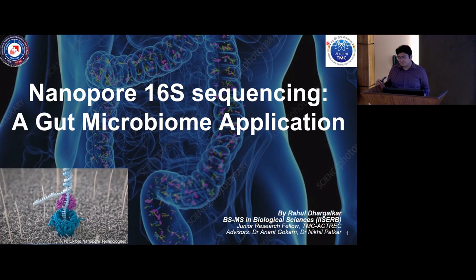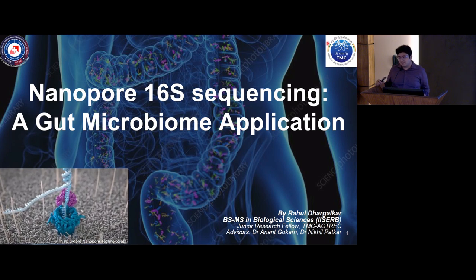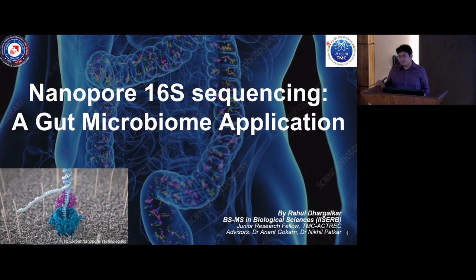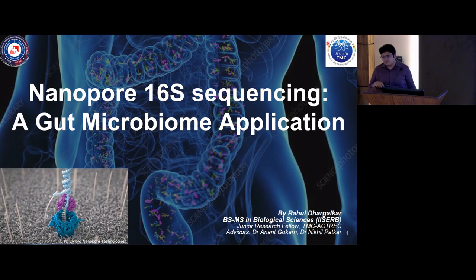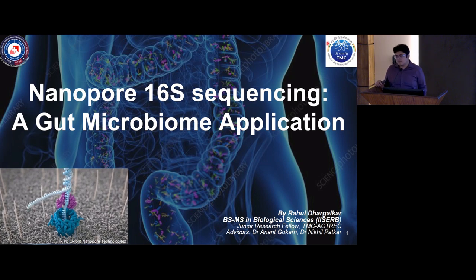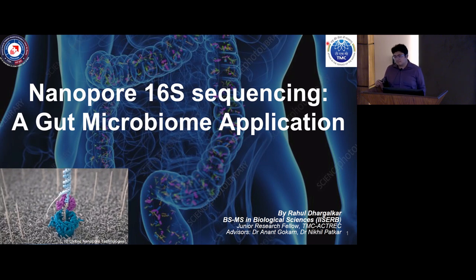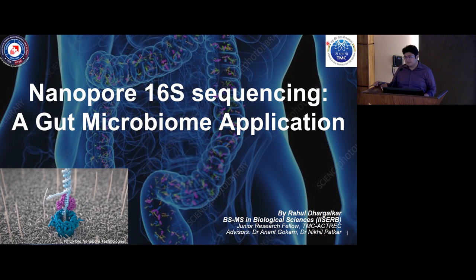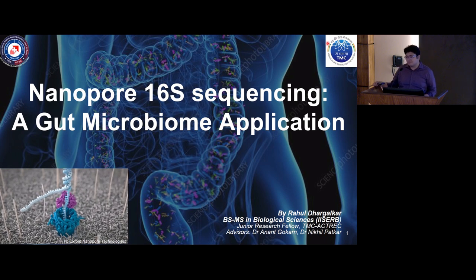The MinION, most likely MinION and Flongle. So MinION and Flongle is... You can even do human stuff on it. So we are working with all different centers in India to do targeted RNA sequencing for ALL using that same machine. It's very cost effective.